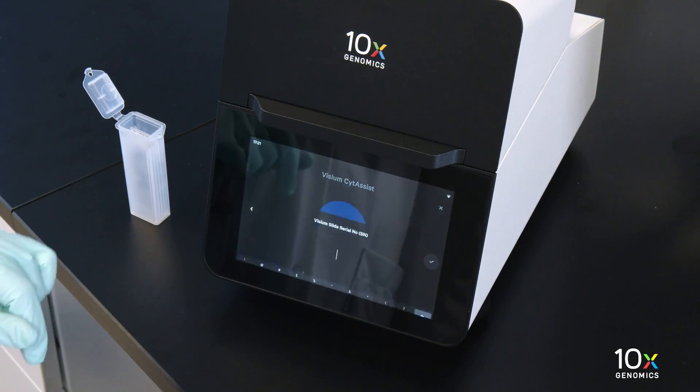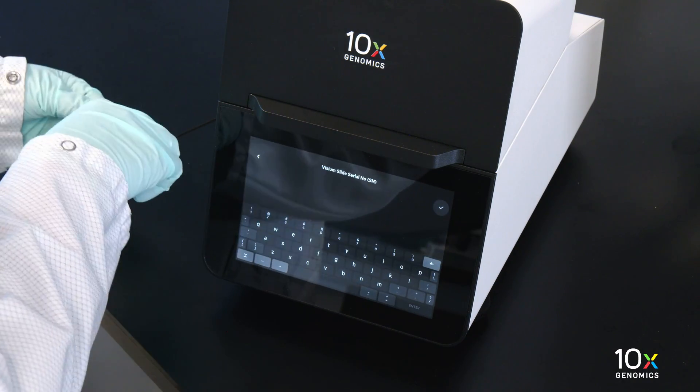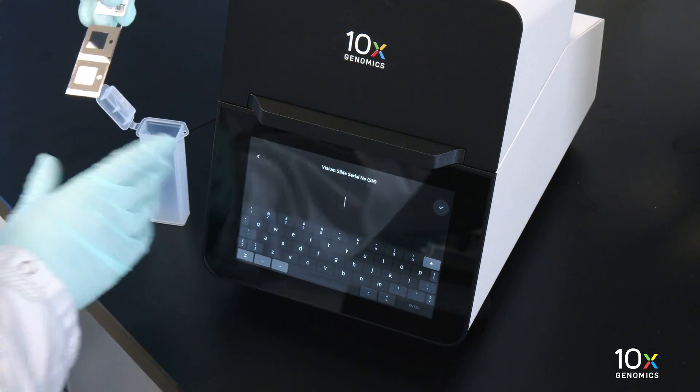Enter the new run information, including the Visium slide serial number. Ensure the serial number is accurate.